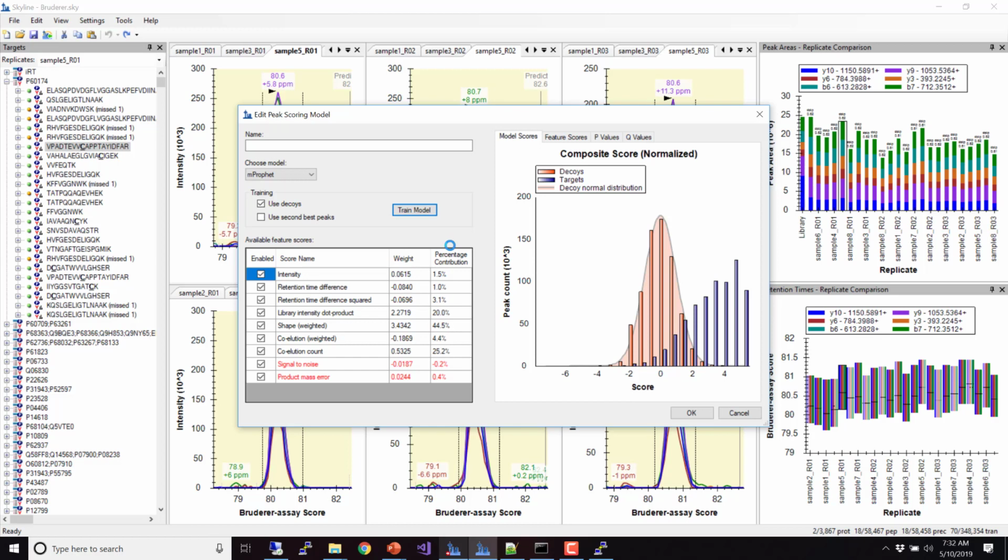So that's that, and there's going to be a pretty low false discovery rate. Because if you would see a higher false discovery rate, there should be another bump here of a bunch of stuff that's essentially random. But there's nothing that looks like our decoys. If you imagine that there actually is a second distribution, it's going to be a very small distribution, because this just looks kind of like 2 distributions. I mean, if it were normal, it should be more like this. And so the fact that we have some tailing over here probably tells us that we do have some false discoveries.